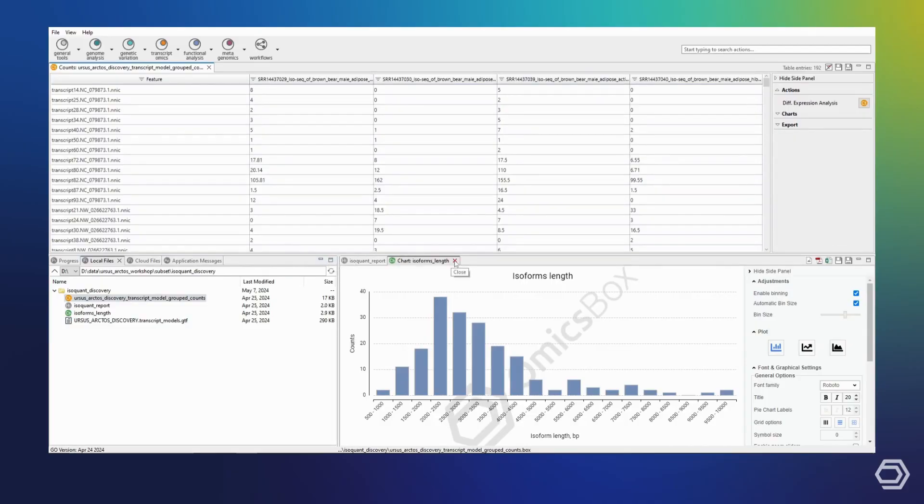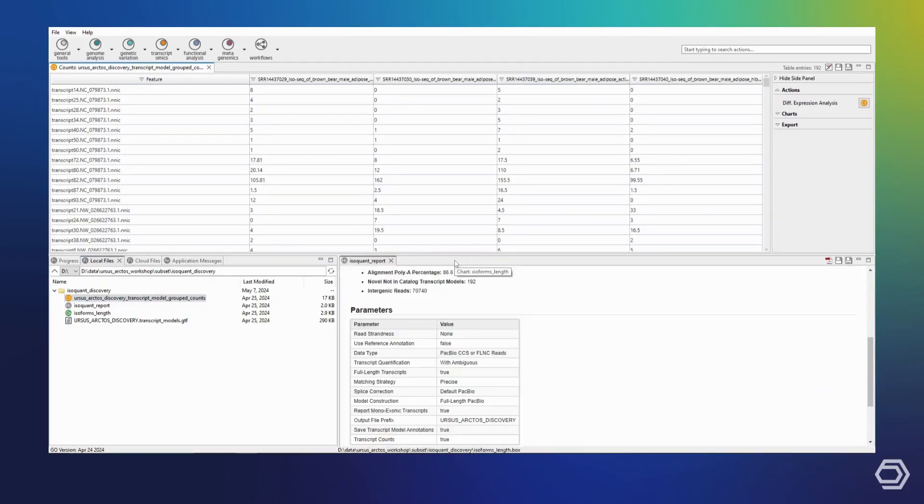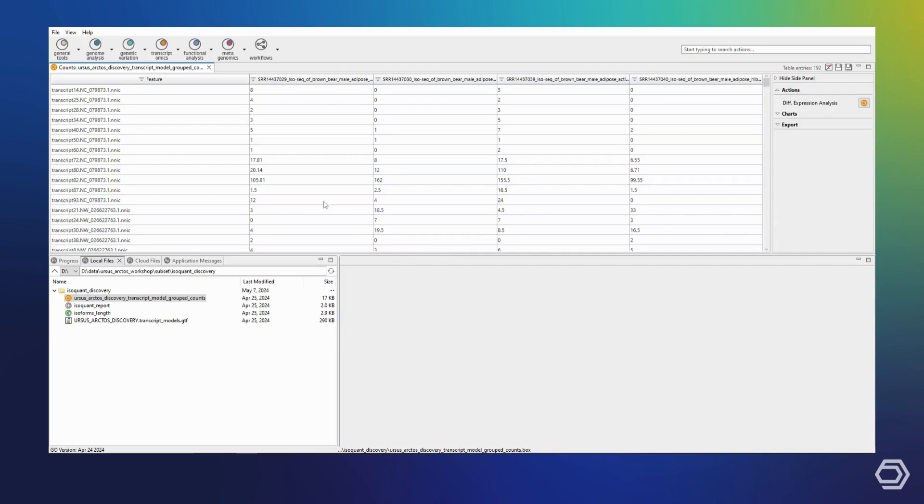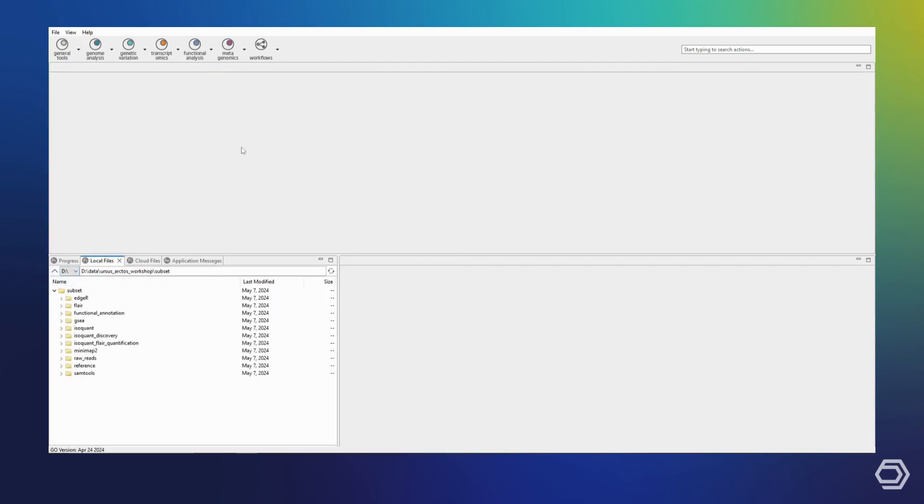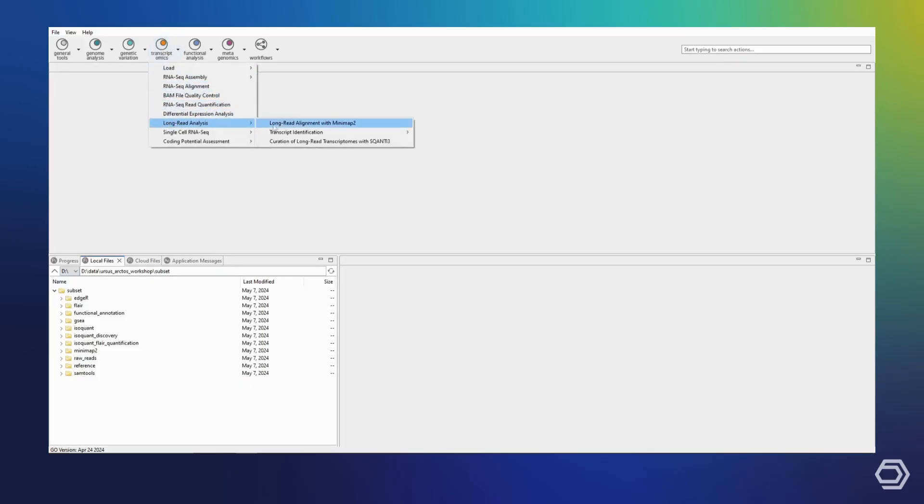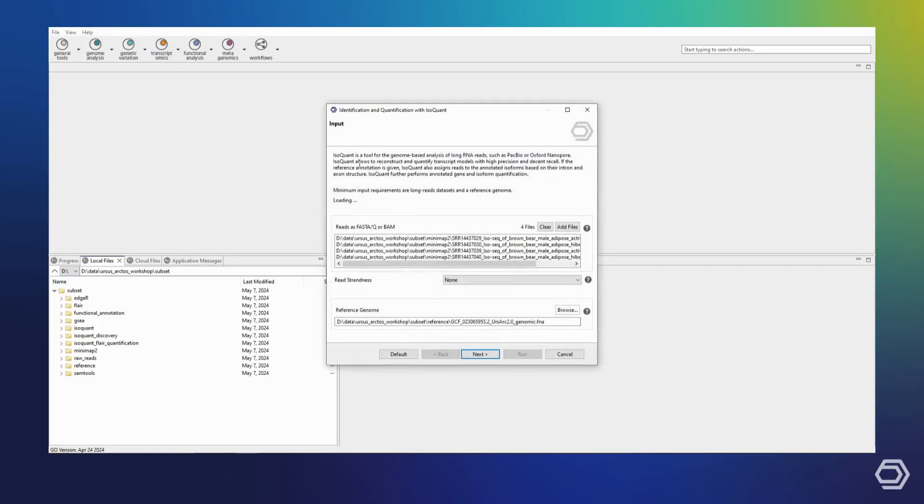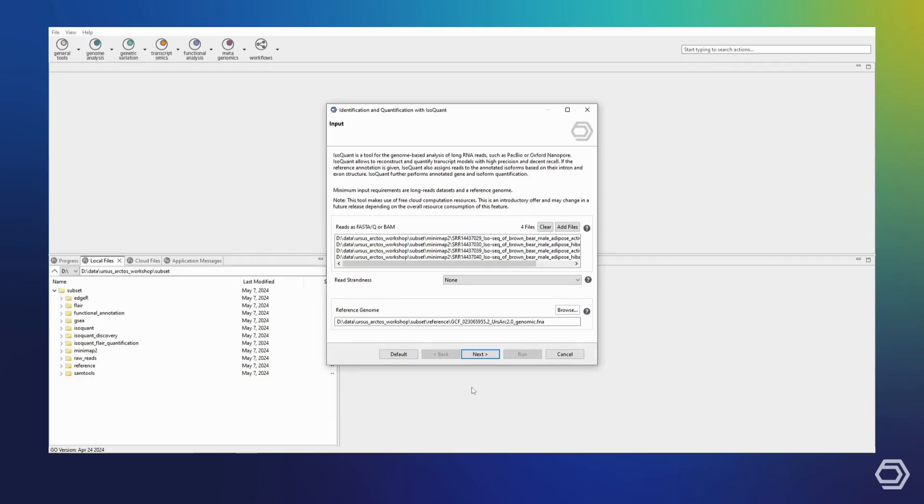Once more, after closing these results, we can show yet another use case for IsoQuant in OmicsBox. Say that I have already used a different algorithm to define a transcriptome. In my case, I have previously run FLAIR, also through OmicsBox, and then further refined the transcriptome using the SQANTI3 quality control, filter, and rescue modules. Now, I would like to use IsoQuant to quantify my reads based on this new refined transcriptome.